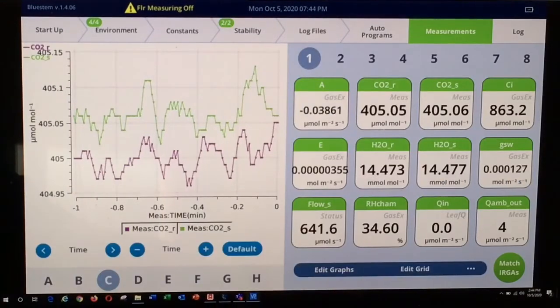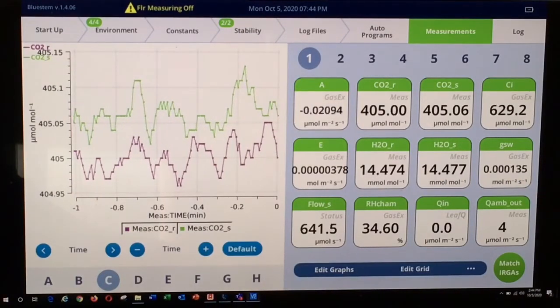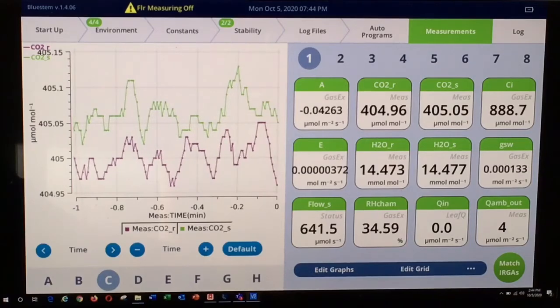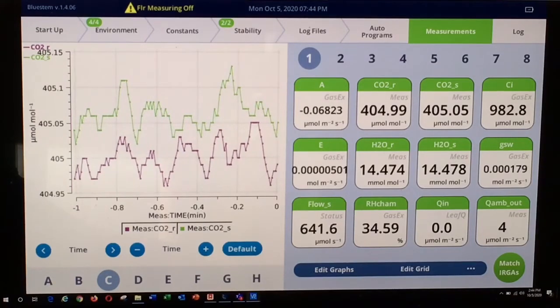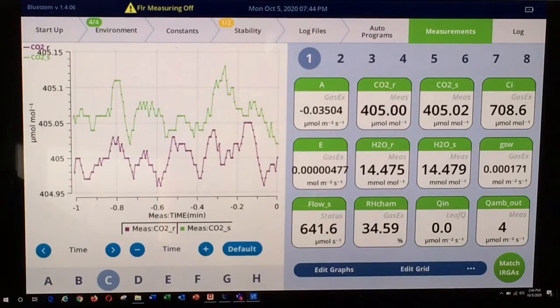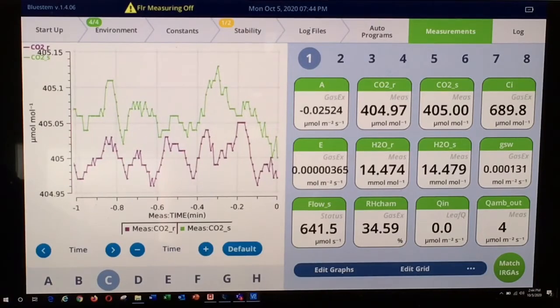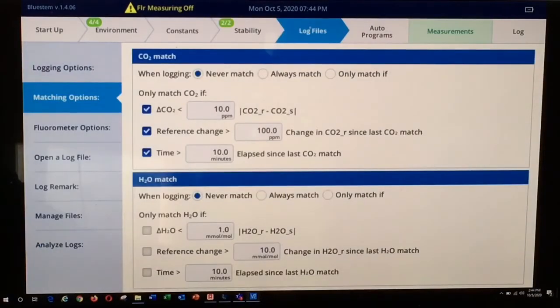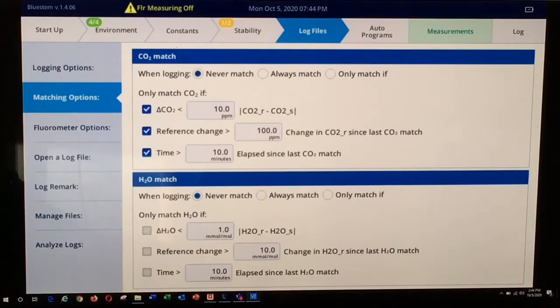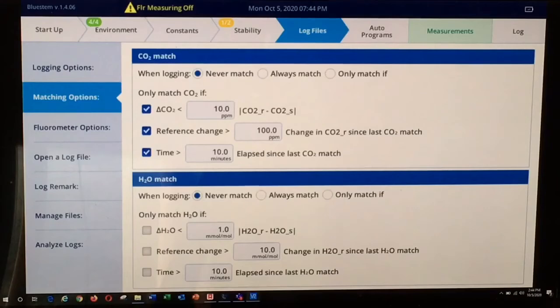Now we have an instrument using the range match function for both water vapor and CO2. Please note that if you want the instrument to continue using the range match function you've implemented, you'll need to make sure that under log files and matching options, your point match is set to never match for CO2 and never match for water vapor. If you inadvertently conduct a point match, the curve may be altered.